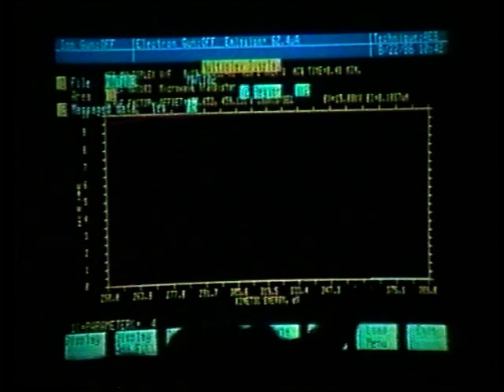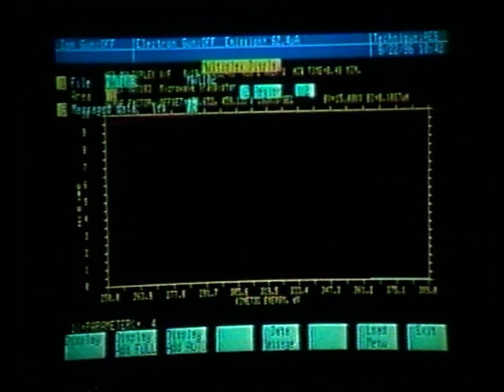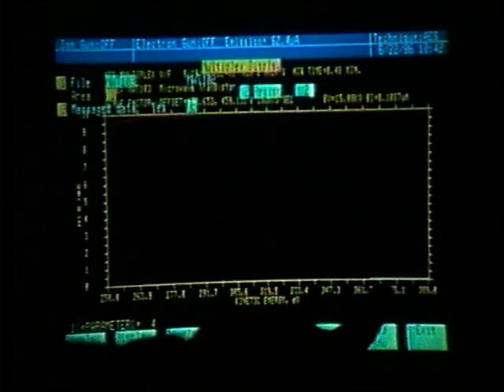And we also see that the nitrogen peak is very, very small. It was a weak peak, and also is very difficult to see. The best method of displaying this data would then be to use the display add full.